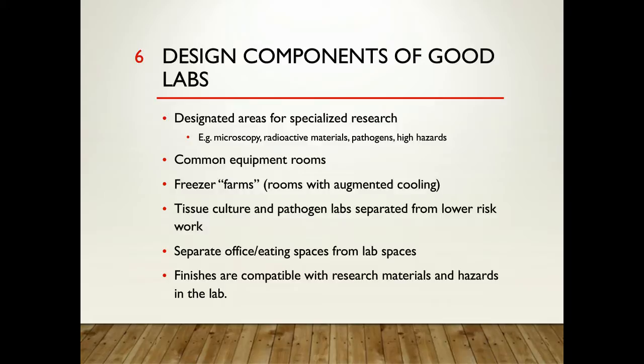And then also it's important to separate office and eating spaces from lab spaces. In the past, there have been designs where they've had desks in the lab space, and in my experience, if there's a desk space where people can sit down, they're going to try to eat there. And so incorporating break rooms and lunch areas into the design of a new space, which we've done with the new Vet Diagnostic Center here at Nebraska, helps eliminate that and pull those food items away from the lab spaces so you don't have that crossover.